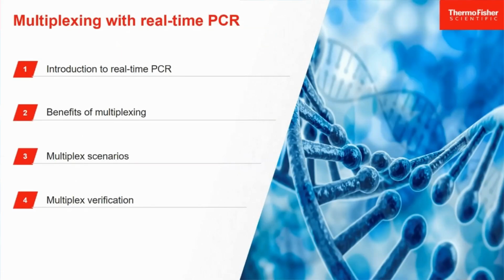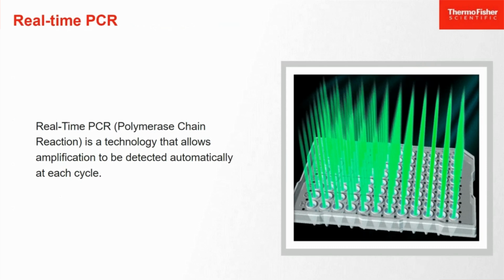Here are some of the key topics. I'll provide a brief introduction to real-time PCR. I'll talk about the benefits, various multiplex scenarios, and multiplex verification. So I'll start out with an introduction to real-time PCR, which is a technology that allows amplification to be detected automatically each cycle.